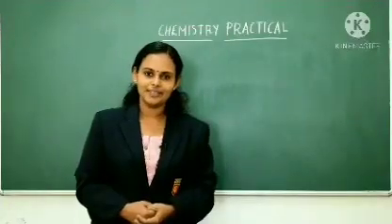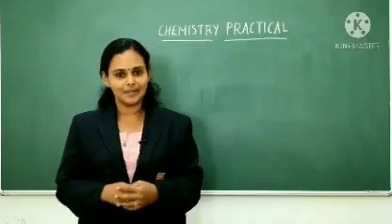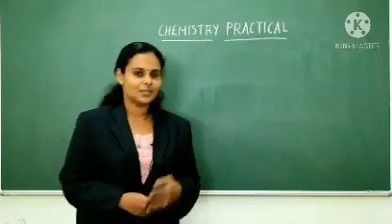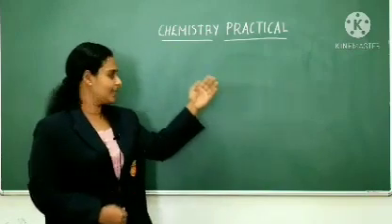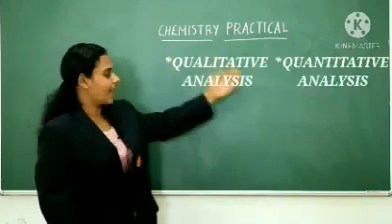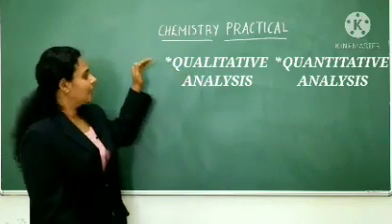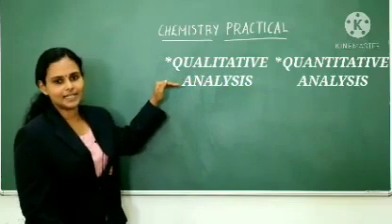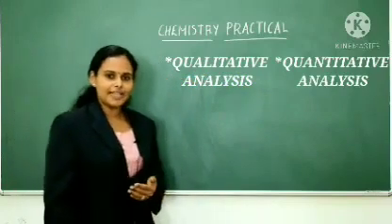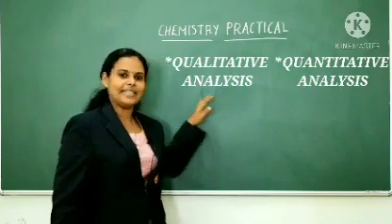Hello everyone. Today we are at the chemistry lab and we are going to start the chemistry practicals today. Generally the chemistry practical is broadly divided into two, that is qualitative analysis and quantitative analysis. This year we will be dealing with both qualitative as well as quantitative. In qualitative analysis we have got salt analysis and organic functional group analysis, which we will see later.